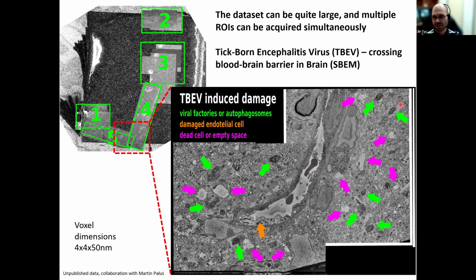There is just the stack of the images that we got. You can see that this is kind of an intersection of the capillaries. One is going from the top, one is going from the left. They join and then continue towards the right bottom, or we don't know where the flow goes, right? So we can't tell.